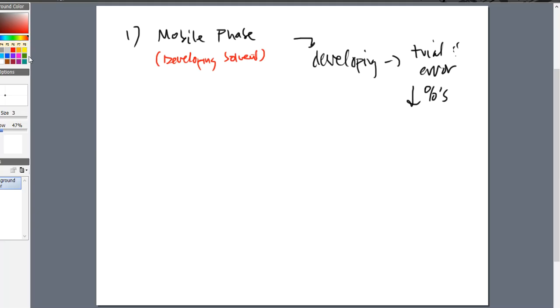For the most of us, though, what's going to happen is that if we are employed and we are running this instrumentation in a laboratory setting, then these things have already been predetermined. I'm following a standard operating procedure. I am following a pharmacopoeia outline that we have to go through, that we have to obey if I'm working in the pharma or the food area. So these are different types of things that I will see. And for the most of us, we're not in research. We're not in development. We leave those to other people, and then we just go in and actually do what needs to be done, and then we produce data, we generate it, print off those reports, give them to the quality units, and they'll be perfectly fine with that.